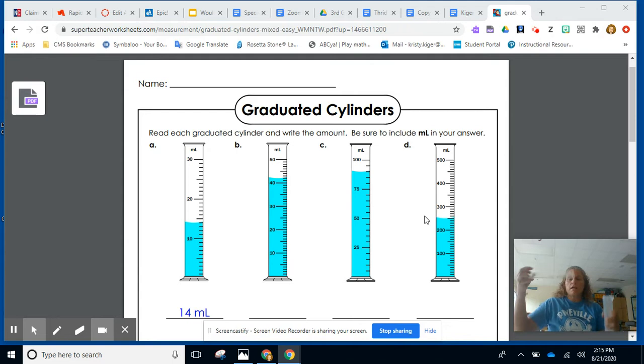I know it's kind of hard to see here, but I wanted to be able to share my screen too. I got this itty bitty one, and they're all different shapes. Well, they're not all different shapes, they're cylinders, but they're all different sizes. Some are very tall, some are very wide like this one. Some are very skinny. So you really have to know how to use them correctly. I'm sharing my screen so that I can show you because I want you to practice this down below and submit it to me.